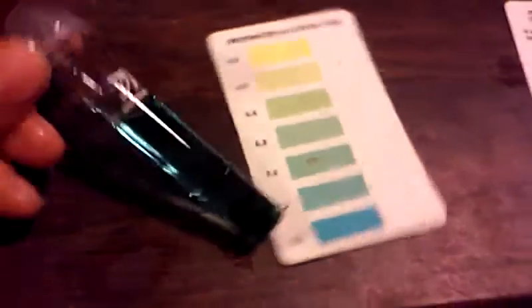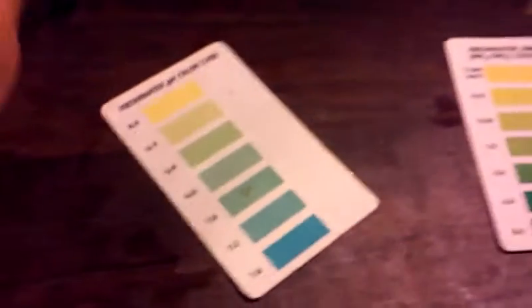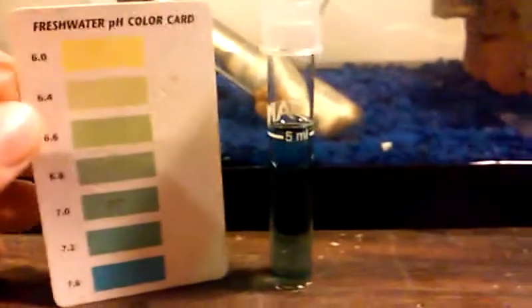One, two, three drops. Rinse off the cover, put the cover back on your test tube, and shake. pH shows up immediately. The pH in this aquarium is around 7.4.